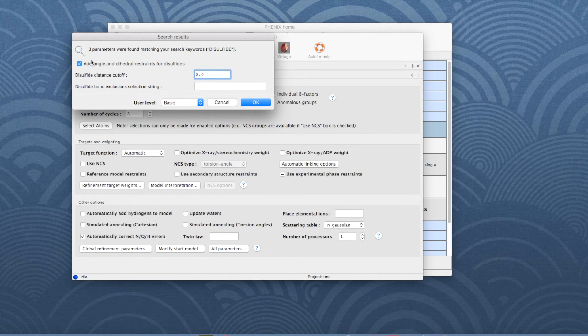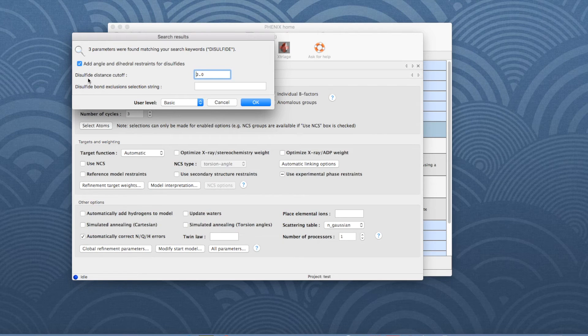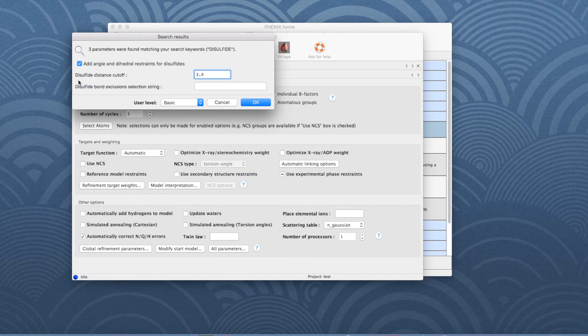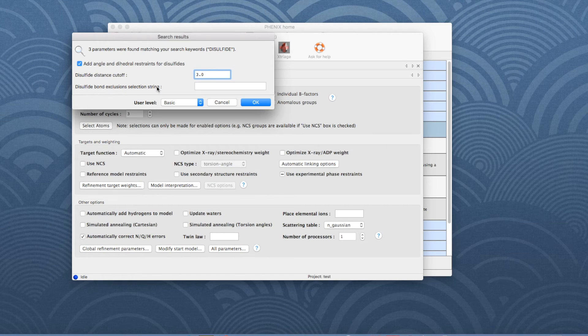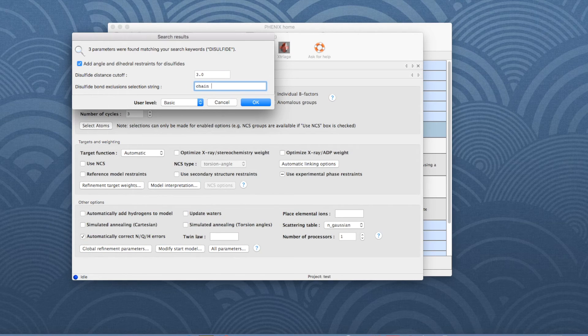In this case, three parameters are listed. Here's the parameter which we want to change in our example: disulfide bond exclusions selection string. In the input field next to it, the default value can be changed.